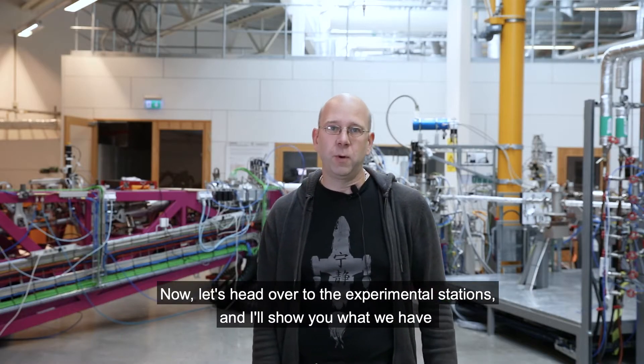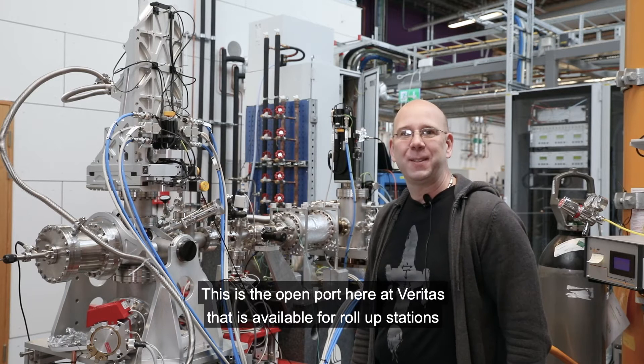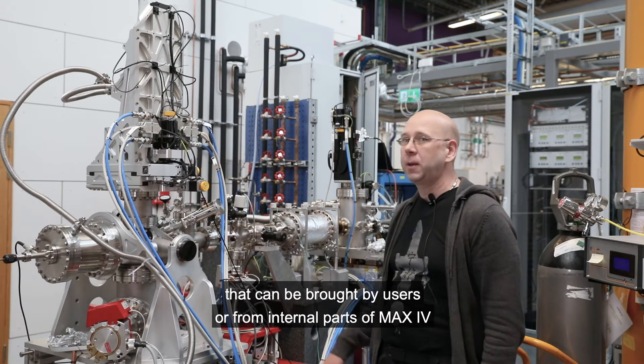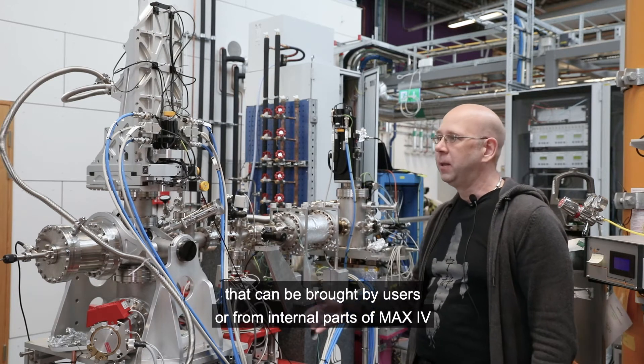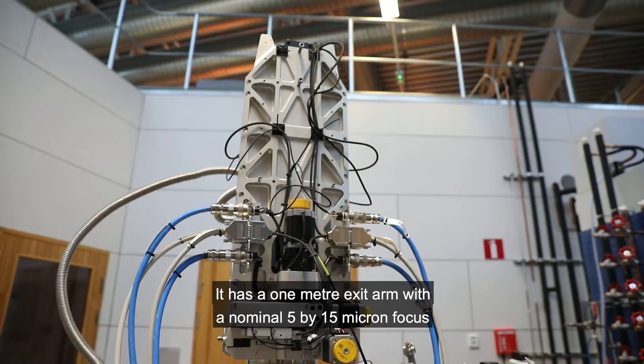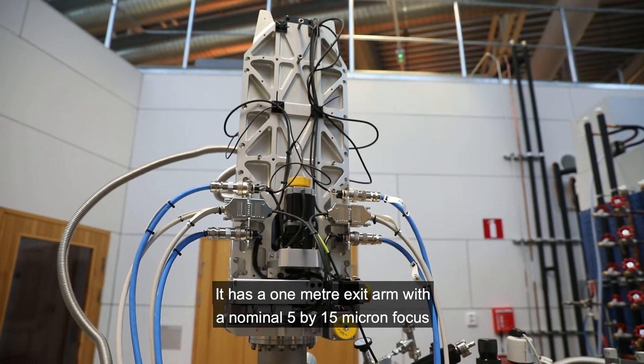Now let's head over to the experimental stations and I'll show you what we have. This is the open port here at Veritas that is available for roll-up stations that can be brought by users or from internal parts of MAX IV. It has a 1-meter exit arm with a nominal 5x15 micron focus.